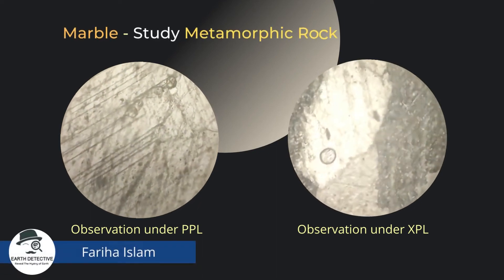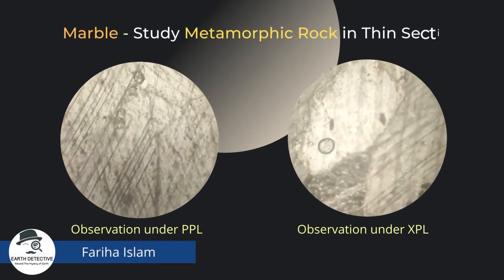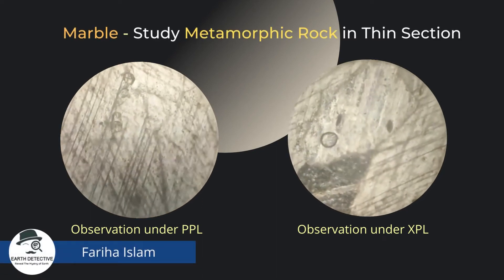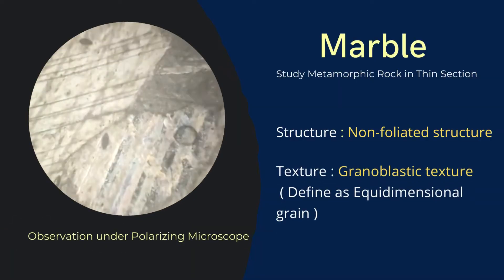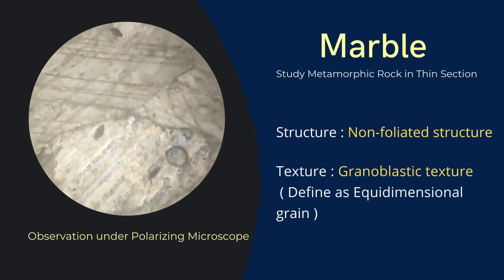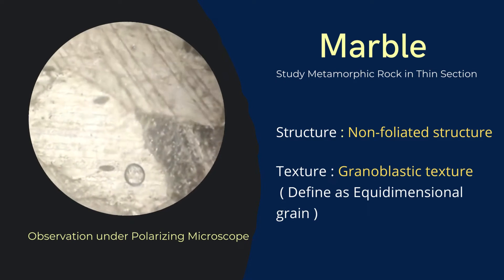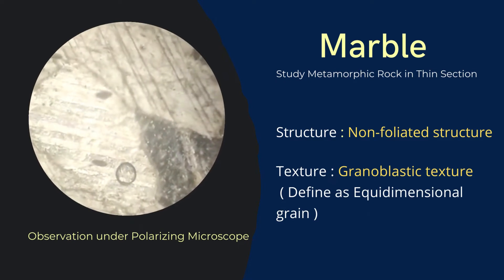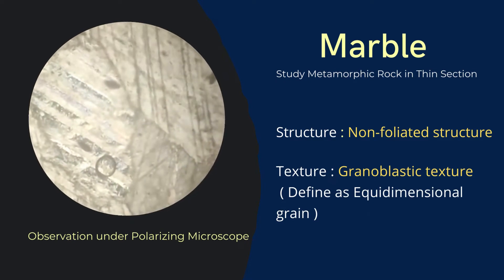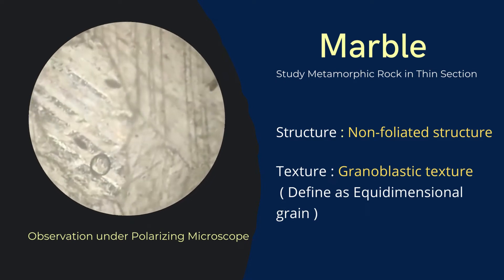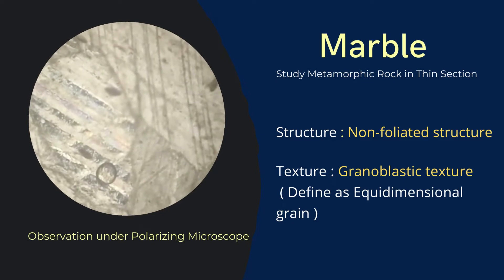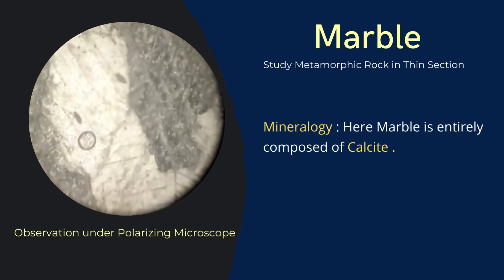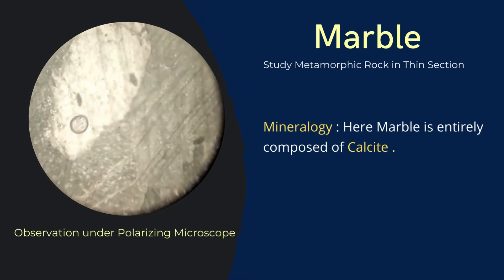In this video we are going to study marble under the microscope. The structure of this rock is non-foliated and the texture of the grains is granoblastic, which refers to equidimensional grains. The rock is entirely composed of calcite.